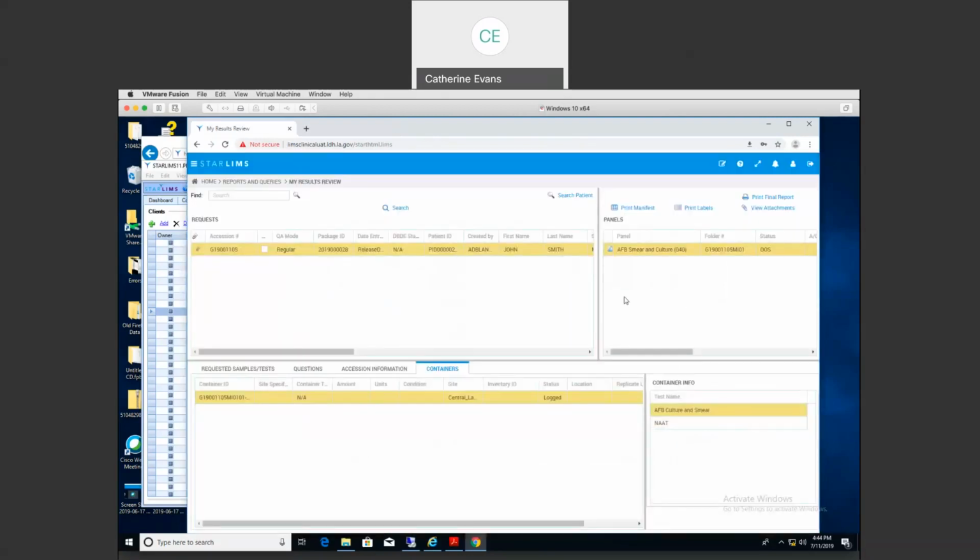That is how the My Results Review application works. This concludes the training for the LIMS version 11 clinical environment. Thank you for listening.